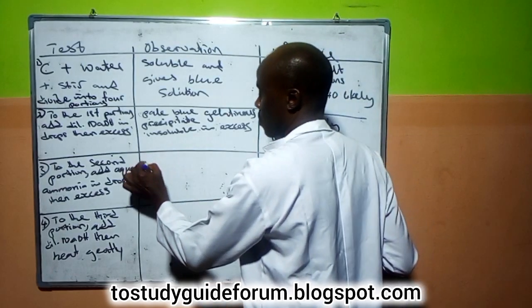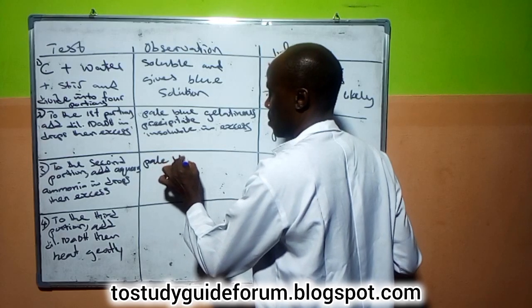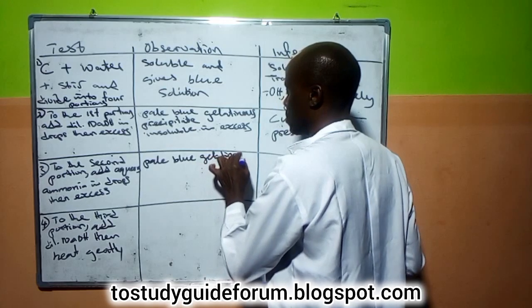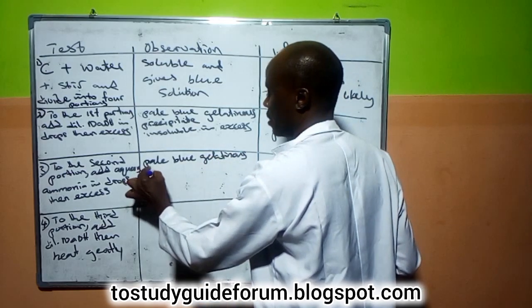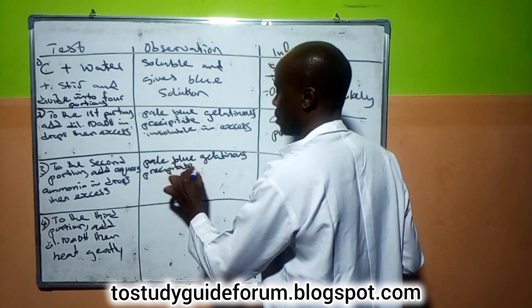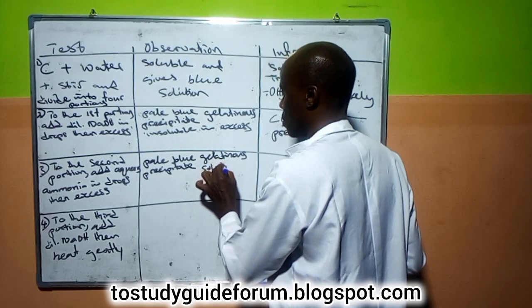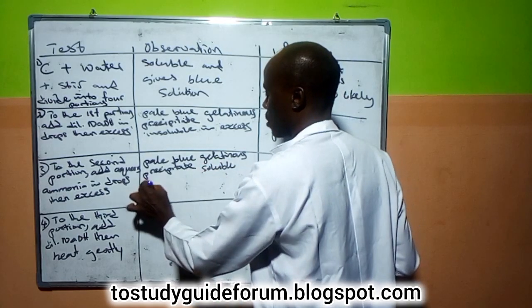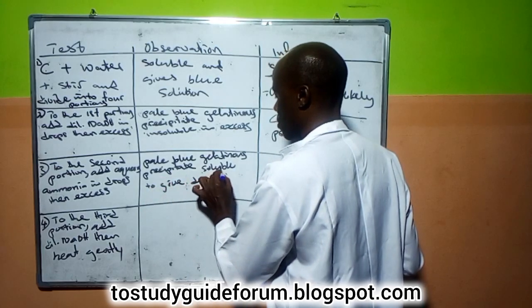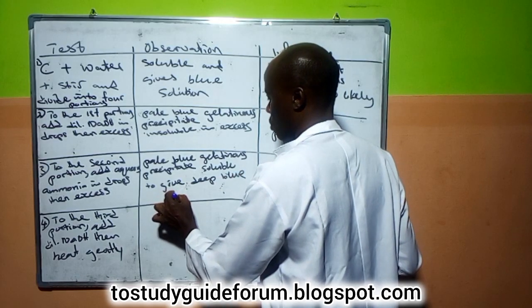this: pale blue gelatinous precipitate soluble to give deep blue solution.